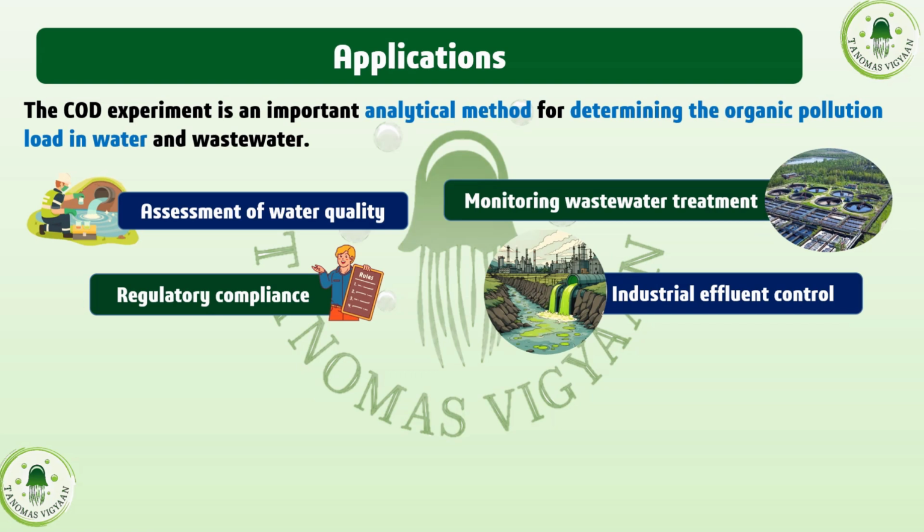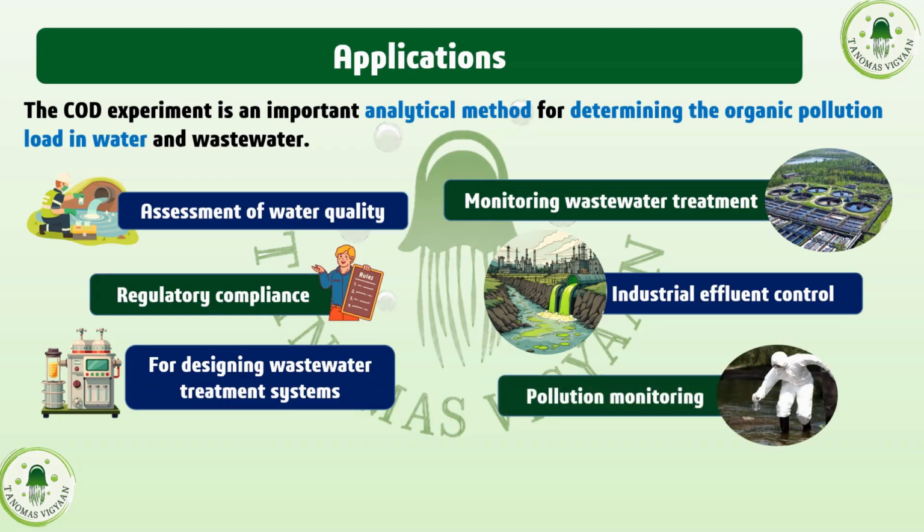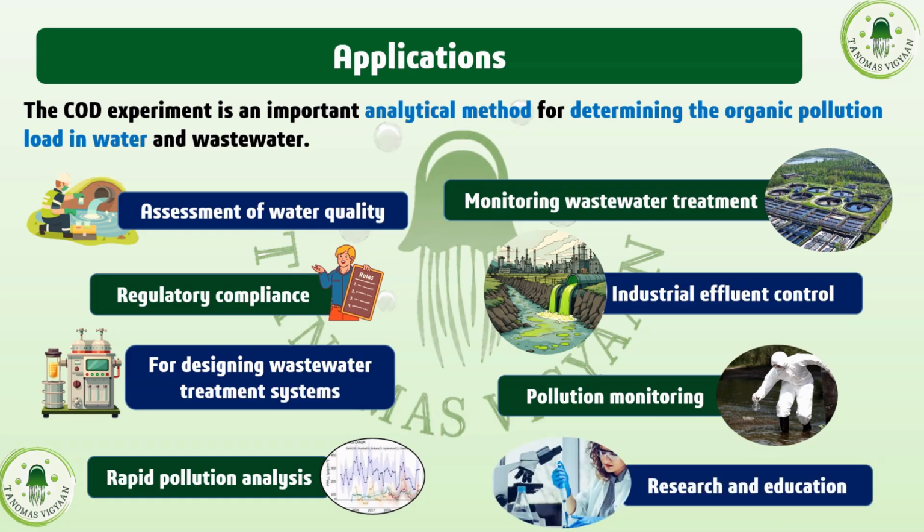The COD estimation is done to check this industrial effluent which is being discharged in the water bodies, right? For designing wastewater treatment systems, pollution monitoring, rapid pollution analysis, and for research and education. Okay, so the COD experiment has all these types of applications. This is very helpful and very commonly used in the labs.